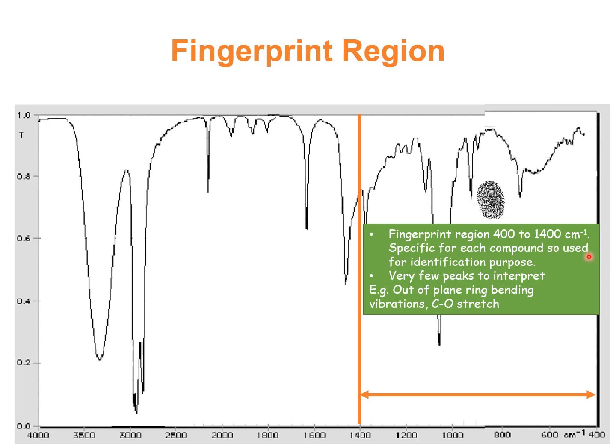They are not interpreted. You just need to overlay and match the spectra of two substances and see how much overlap they have. If they match perfectly, it means these two spectra are coming from the same substance. That is why every pharmacopoeia mentions infrared spectrum peaks for identification of compounds.